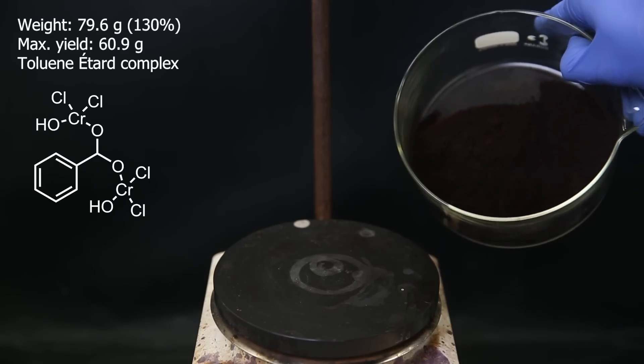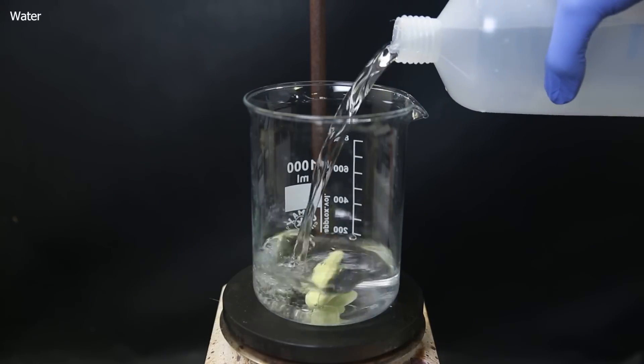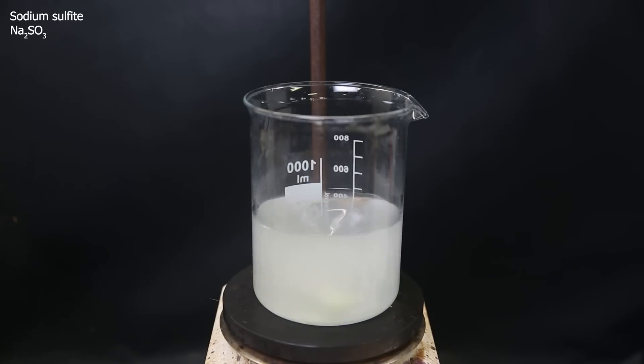Now for the next step, we will destroy the complex to give benzaldehyde. So I set up a large beaker with a stir bar and add in a bunch of water. I then saturate the water with sodium sulfite, which will reduce any toxic chromium-6 to the more friendly chromium-3.